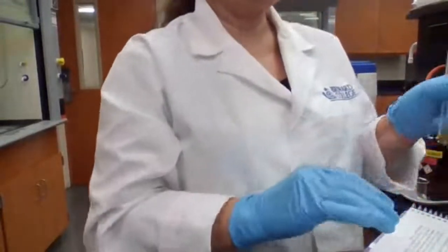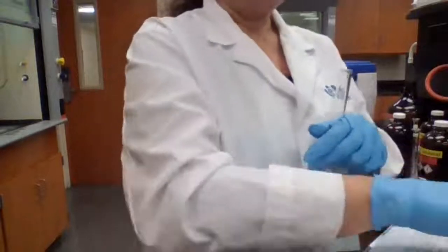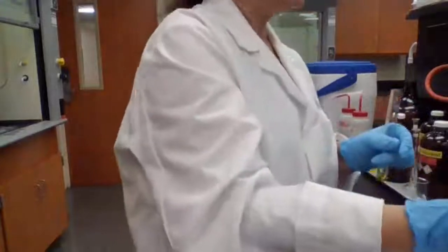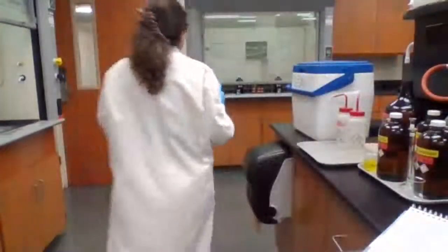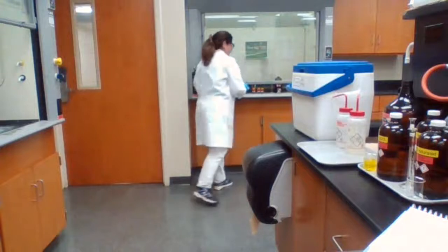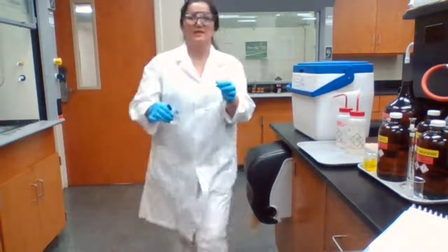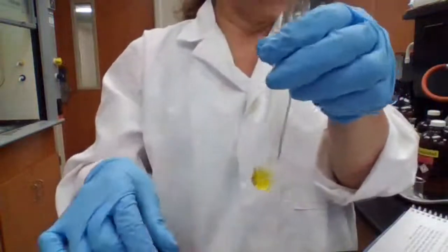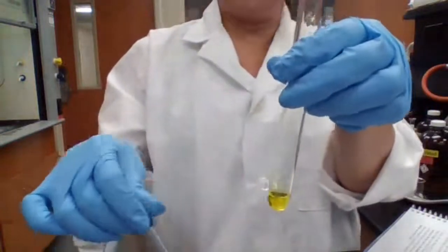And to this, we're going to add 3 molar H2SO4, dropwise, until you see the color change.